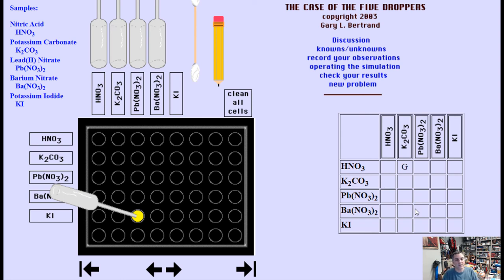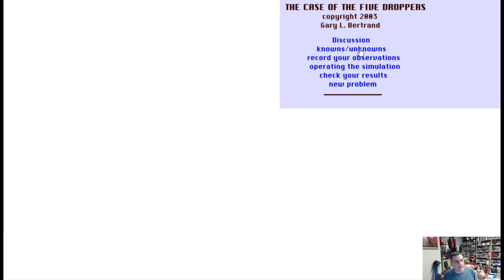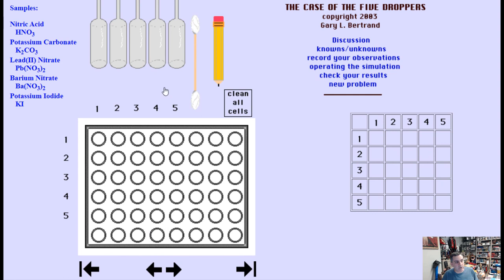You're going to work through Dr. Taylor's activity here, and then at the very end once you kind of feel comfortable, you're going to be challenged and we're going to do some critical thinking, Wabash style. When you're all ready, you're going to probably reset. Then when you're ready to go, you're going to click knowns/unknowns. This is going to reset and give you a totally new one where these chemicals, it's the same five chemicals, but you don't know which is which.